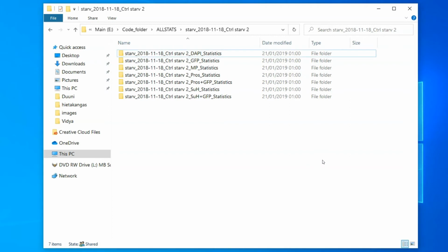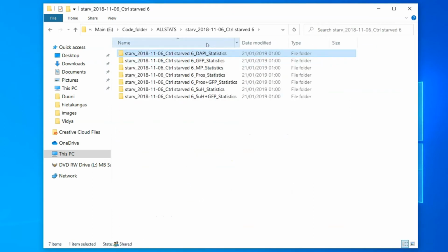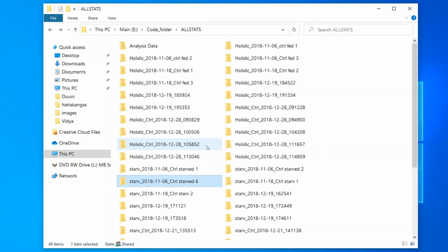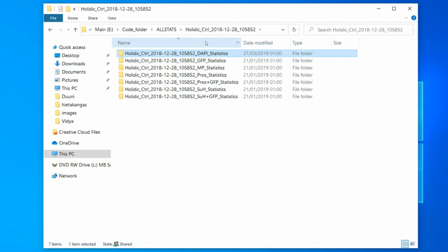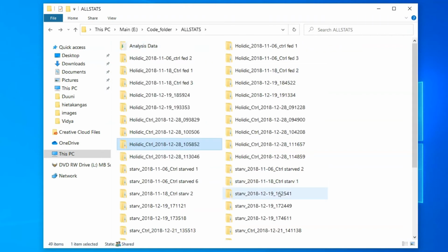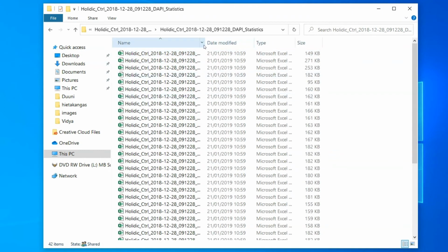Each folder will be joined with similarly named datasets from other samples, which will then be analyzed as a unique dataset. We have named the data folders according to the labels or markers that the objects originate from, followed by the extension statistics that is added by Imaris. All data pertaining to the channel must be within its folder and in CSV formats.